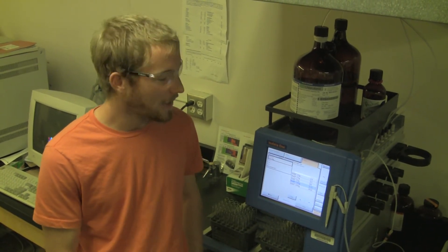This machine can detect what wavelengths of light are being absorbed by the materials going through the machine and absorb pure fractions, meaning that while purifying our materials, we can be setting up other experiments.